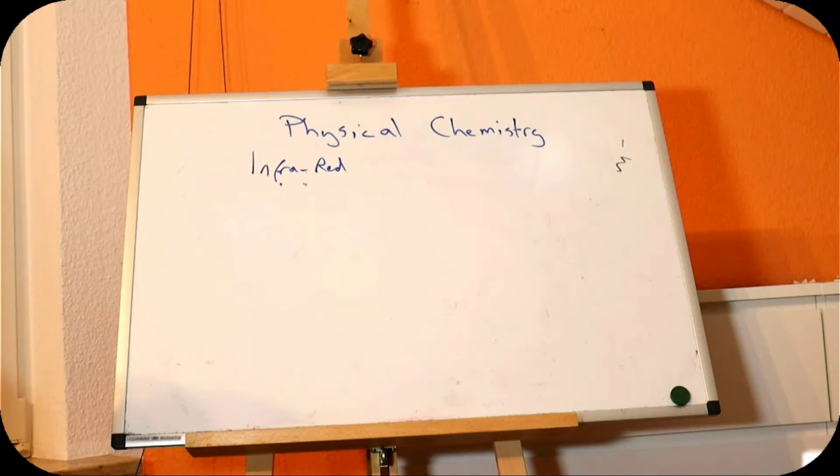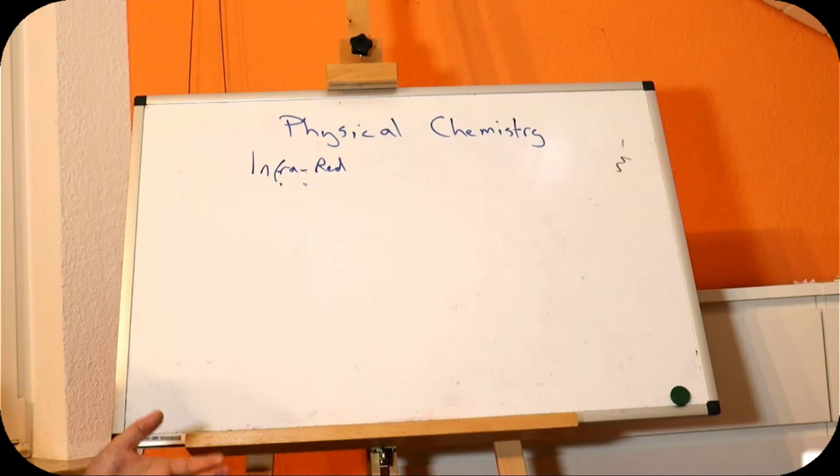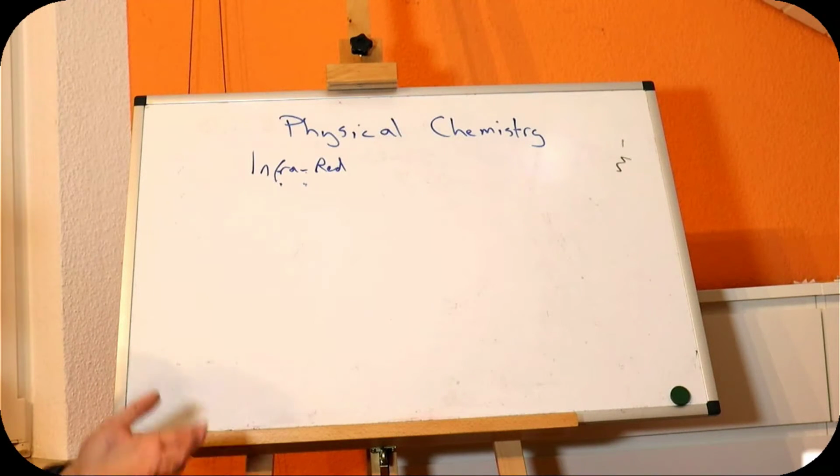So if we use a polymer as a container, which we would do for UV vis spectroscopy, because all we need is something that doesn't have too many double bonds in it, and even then what we really only need is something that doesn't have double bonds that are 1 bond apart from each other. So we've got a large range of possible materials there that are transparent in much of the visible region. But in infrared we don't have that. In infrared we will see polymers and we will see many inorganic species.